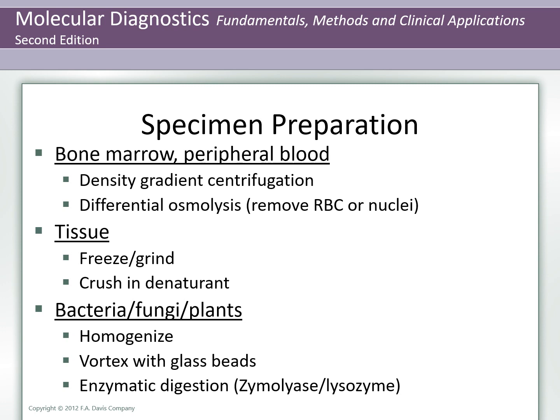Specimen preparation is similar to the procedures discussed in the DNA extraction methods section, but differs in some respects, remembering that RNases need to be inactivated. Red blood cells in blood and bone marrow are lysed by osmosis or separated from white blood cells by centrifugation.